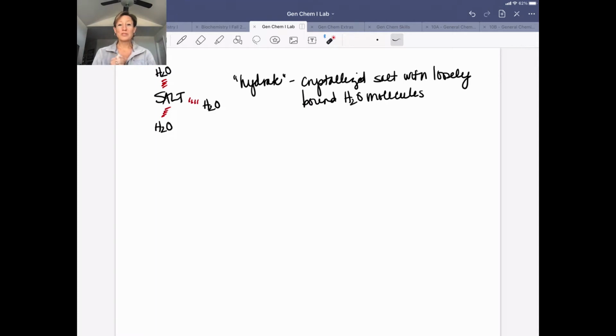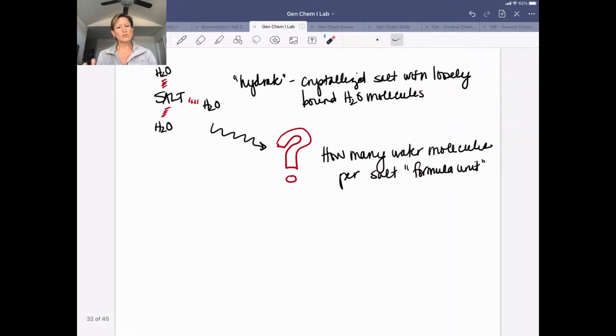Hi guys, so this video is going to walk through the theory behind our lab on the stoichiometry of a hydrated compound. So first of all, what is a hydrated compound? Well, a hydrate is a crystallized salt that has loosely bound water molecules. So again, a salt here is going to have some water molecules associated with it. So the question is, how many water molecules are associated in this salt per formula unit?